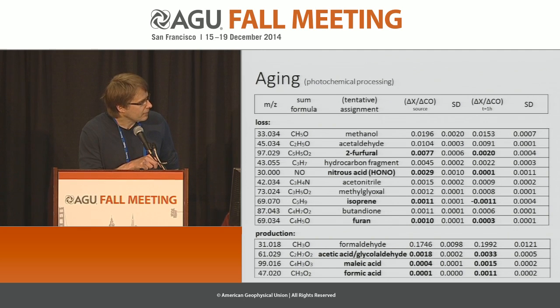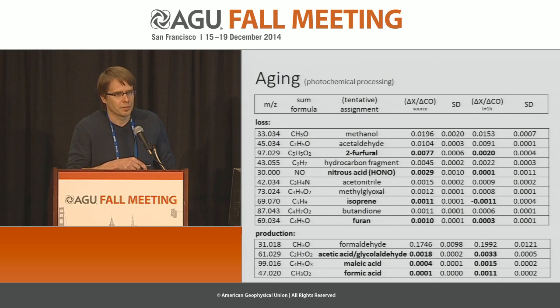So it's, okay, it's statistically relevant, but barely. And the other thing is, of course, the fire has some natural variability. And so we didn't really sample it at the same time. So that's the only explanation I have. You know, it may have emitted a little bit less acetonitrile when it was emitted actually 1 hour before, and that's why it dropped. But that shows you clearly also the limitation of this method. That's why I wanted to put the focus on those where we really see a clear decay.